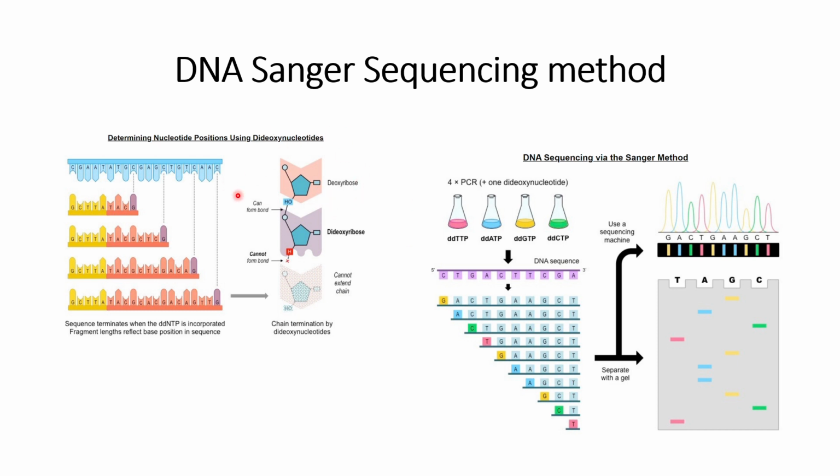It is usually the nucleotide that is present in the DNA, and because of the presence of this OH group, it helps with the further extension of the DNA. It will bind to another nucleotide. However, when the nucleotide is present as a dideoxyribose, then instead of having an OH group, it only contains a hydrogen. Because of this, it will prevent further extension of the DNA.